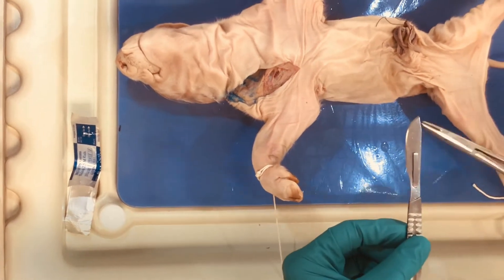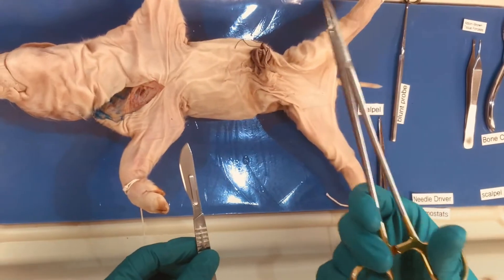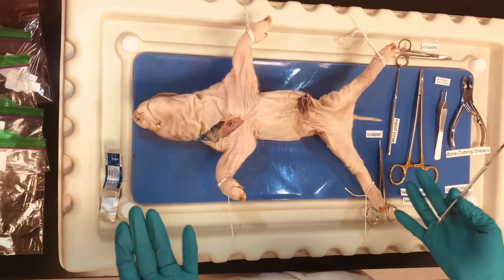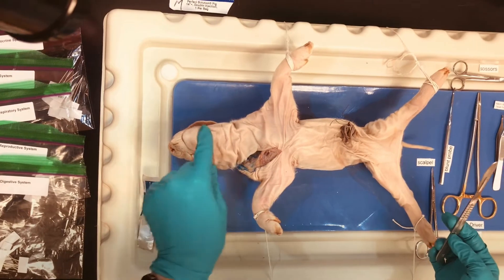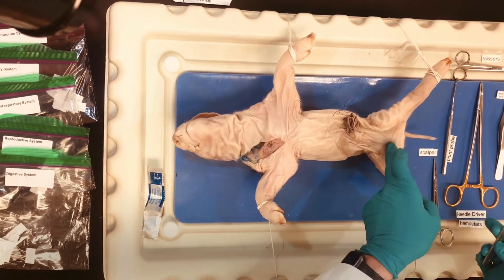So this is our scalpel blade, this is our scalpel handle, and we used our needle drivers which have locking capability to put that on. When we begin our dissection, the first thing we're going to do is make a linear incision from the cervical area down to the pubic area.